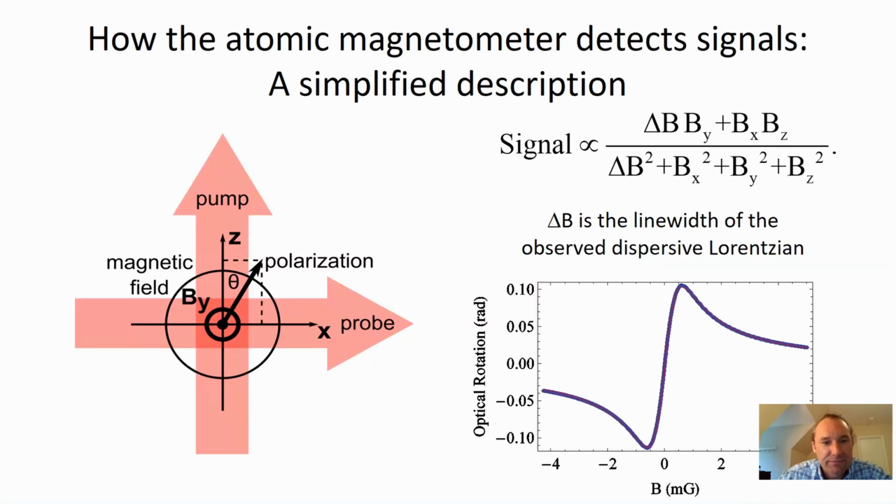Thomas, actually, one more relevant question. Which parameter determines the range of linearity of the method? Is there something that can be tuned? Yes.